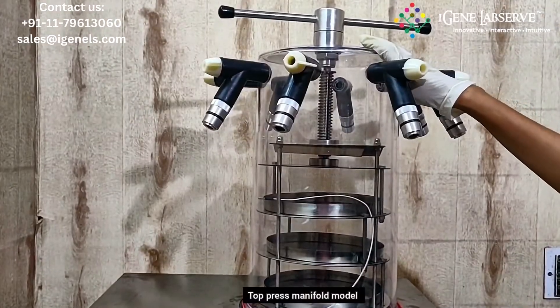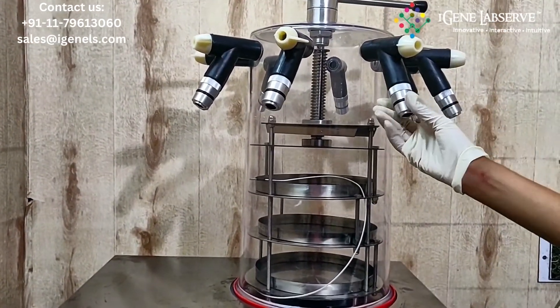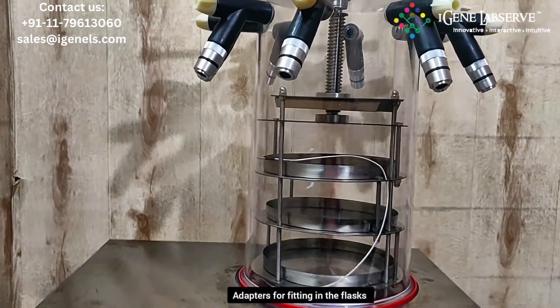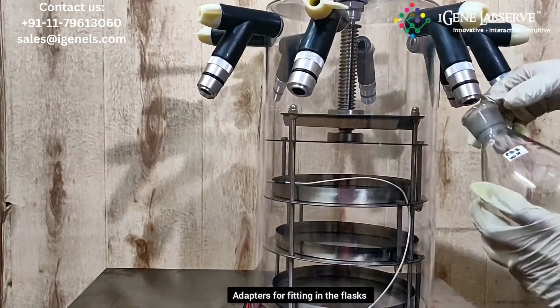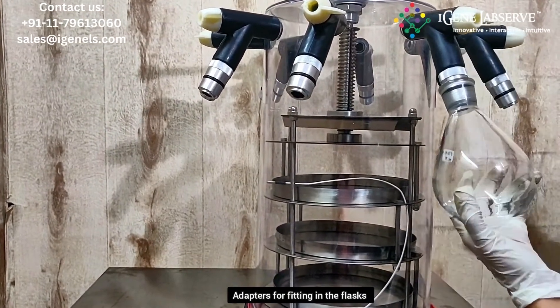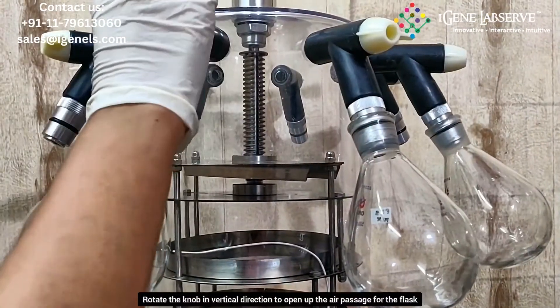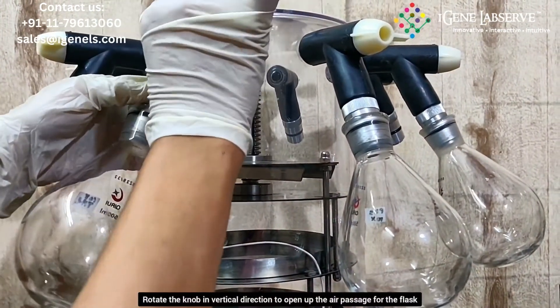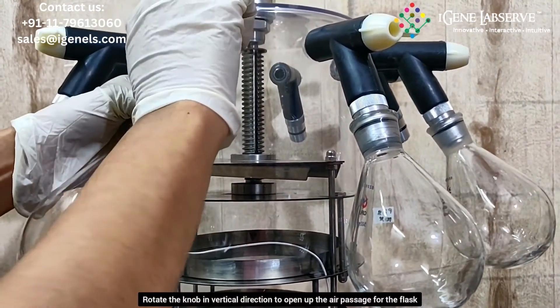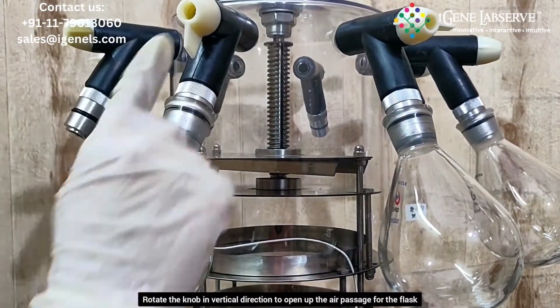Top press manifold model. Here, these are for placing the glass like this. This is the off position. And to open this, you have to rotate it like this, and it opens up.